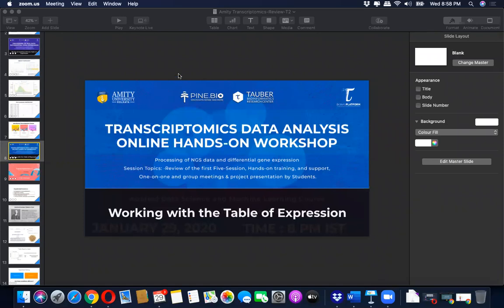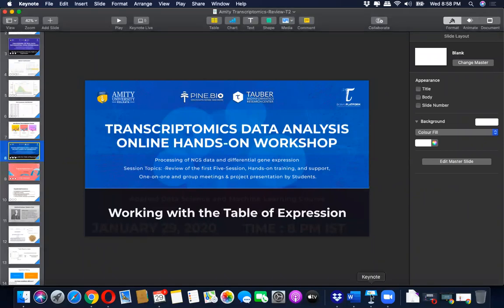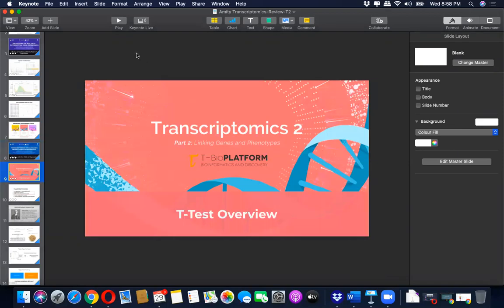So as I was telling you guys, today we are going to start transcriptomics 2 a little bit.